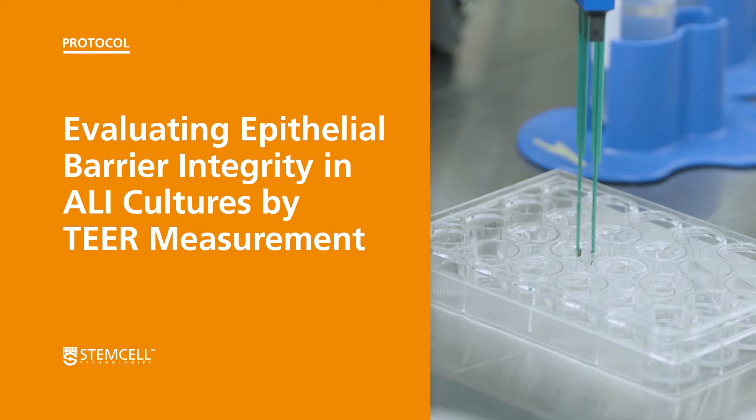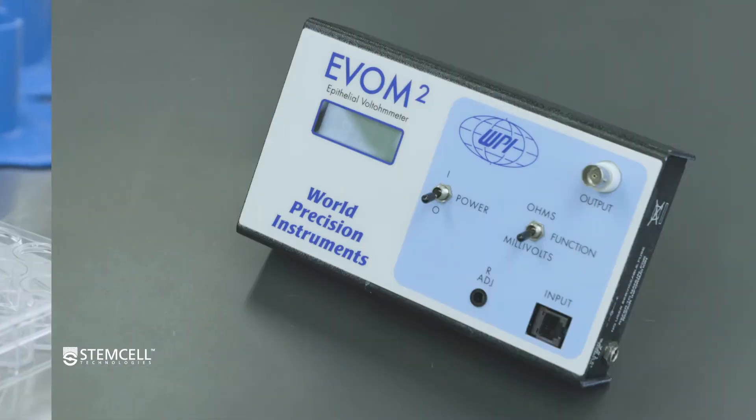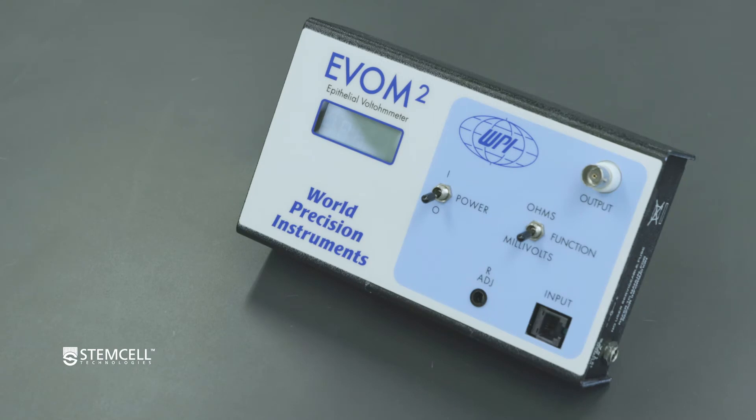In this video, we will show how to measure transepithelial electrical resistance, or TEER, to evaluate the epithelial barrier integrity in an air-liquid interface, or ALI, culture. We will use an epithelial volt-ohm meter, or EVOM, from World Precision Instruments to illustrate the procedure.